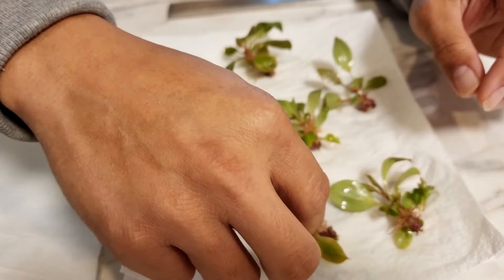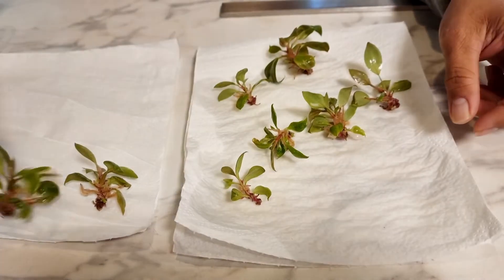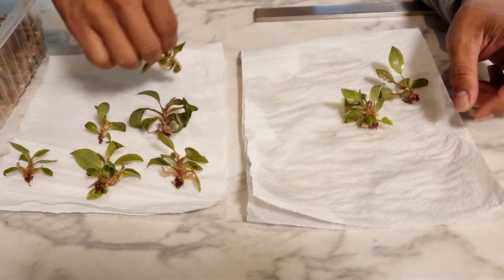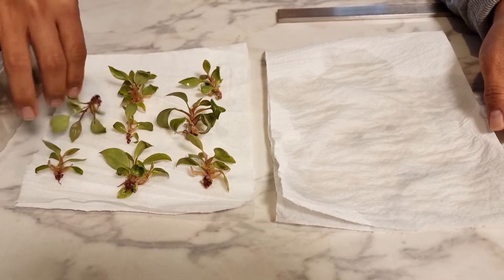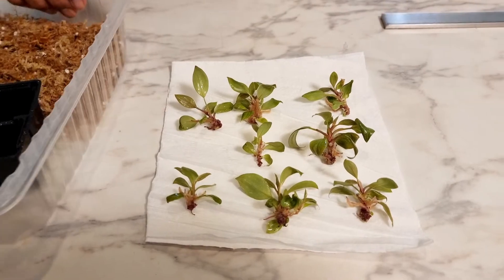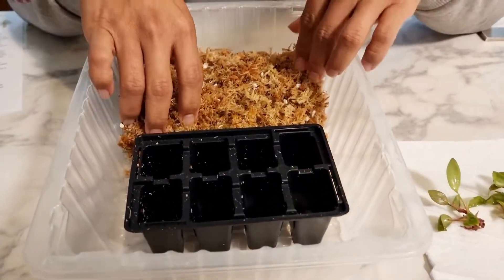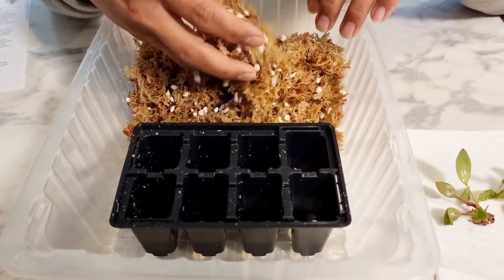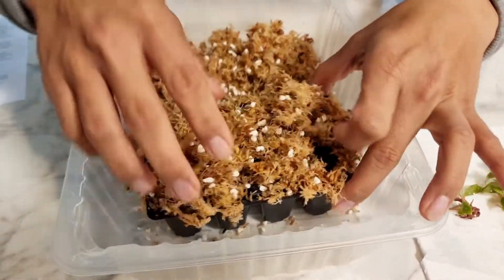Once they're all washed off, continue drying them on a fresh paper towel to remove excess water and plant parts. They don't need to be super dry — just remove the excess water, that's all. While they're drying, we'll prepare the planting tray. We have the media here — it's chopped sphagnum moss mixed with fine-textured perlite. Now we just place that in the tray.